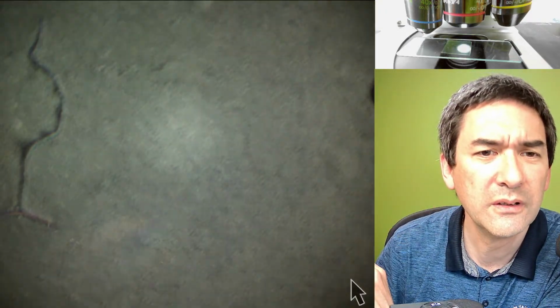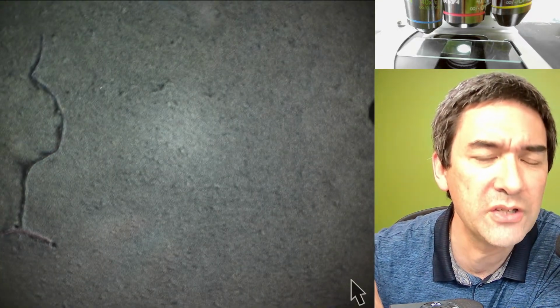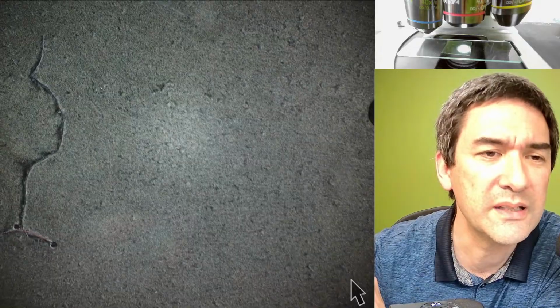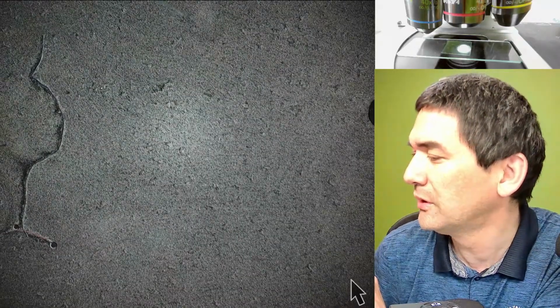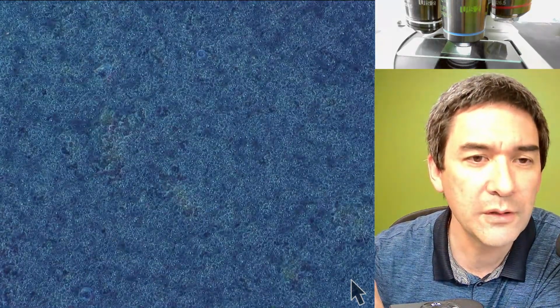So this would be now dark field. Okay, so we're not able to see a lot because it's way too. Yeah, no, it's not good. Unfortunately. One of the things that I could try is phase contrast, but I think I lost it. No, here we go. That's now phase contrast. Also not the best. I think I'm just gonna stay with DIC or bright field.